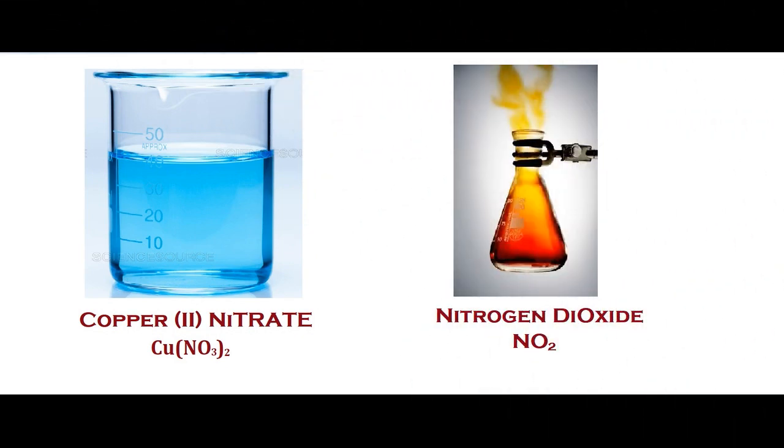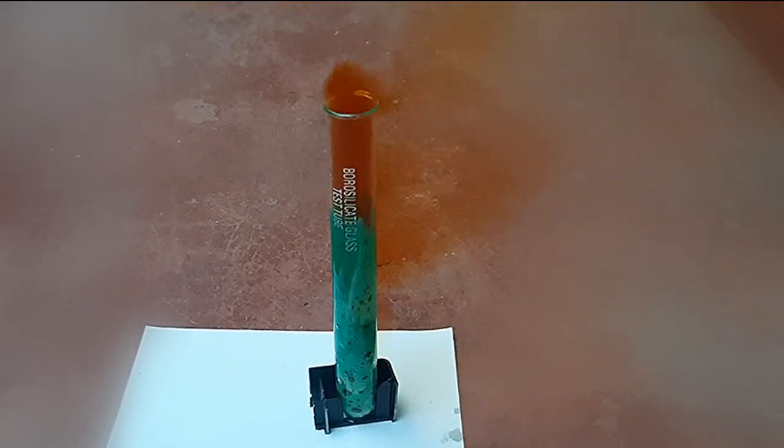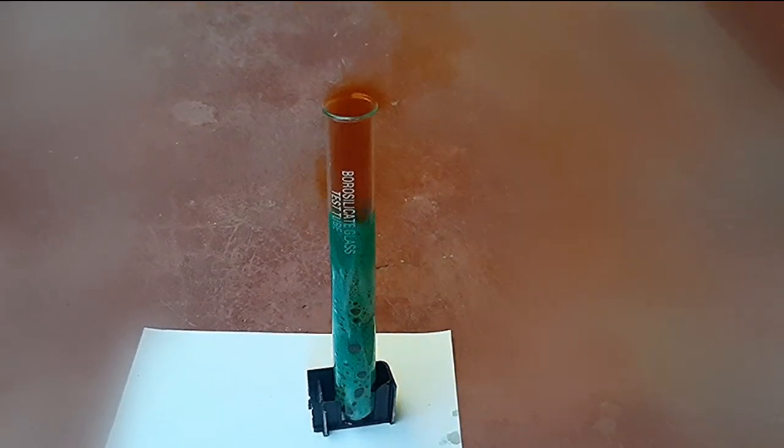And the reddish brown gas evolved is nitrogen dioxide. Nitrogen dioxide is a poisonous gas. Let's take a look at this again.